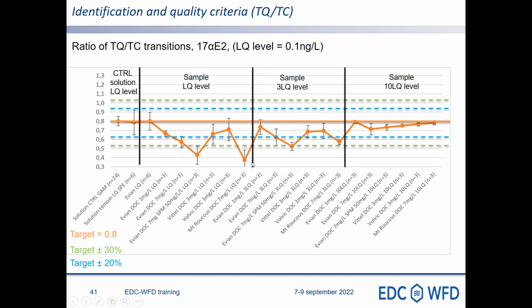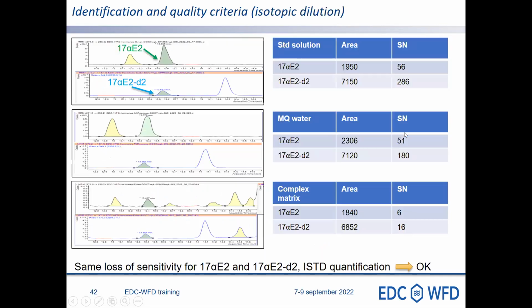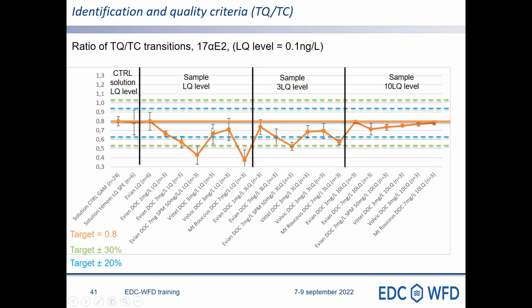and it is also important to keep the instrument clean, because when you are facing routine monitoring and a high level of injection rate, I would say, in your instrument, you really have to take care to prevent drift by cautious cleaning of all the instrumentation over time. But when you do that, you are in the pipe, and you are in the pipe even at the lowest concentration.